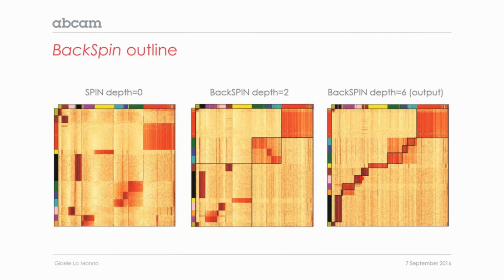And as you can appreciate, this is quite good, resembling the groups of cells and group of relevant genes that are basically relevant, even though this matrix contains a lot of noise, as you can appreciate on the background here. Yeah, so that's all about the data analysis and the technical protocol, and now I will hand over to Gonçalo.